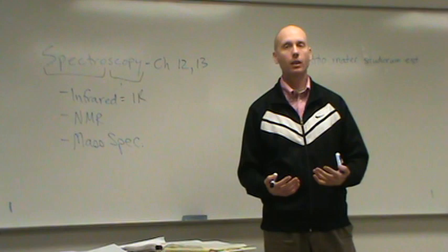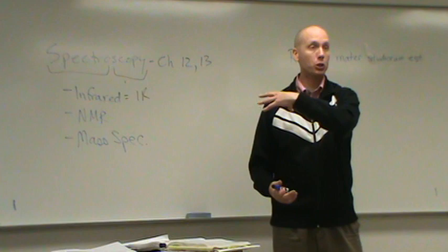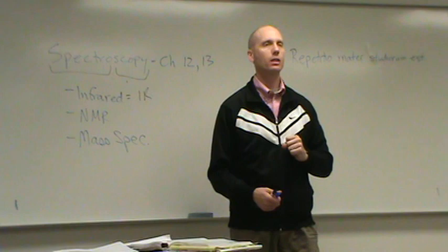Okay? Because you might have been asking that. I mean, we've been drawing molecules, looking at reactions and benzene. But how do we know that we're dealing with what we say that we're dealing with? It's nice to put it on the board, but when you get in the lab, how can I know that that really is benzene or that's methanol and so on? Okay, this stuff here is where we learn to identify molecules.